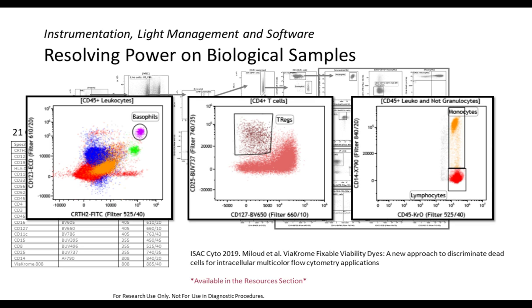And here we have a spectrally isolated possibility on the IR laser to have bright signals from the monocytes without any impact on others. At the same time, the IR laser detectors are not subject to spillover from other laser detectors, so you can also very nicely detect those dim expressors.